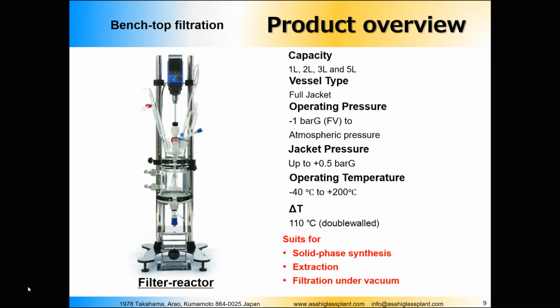So due to the heat transfer coefficient, the expansion on the hot surface occurs very quickly, and the expansion on the cold surface, which is cold because the heat doesn't pass through the glass quickly, occurs very slowly. So in this case, that's how the crack actually appears, because on one side the glass expands, on the other side the glass doesn't expand.